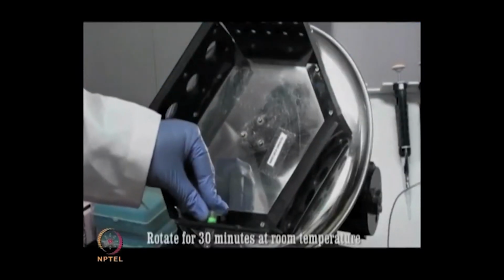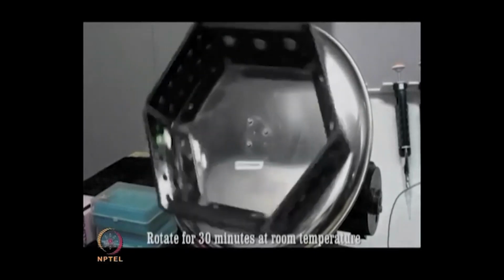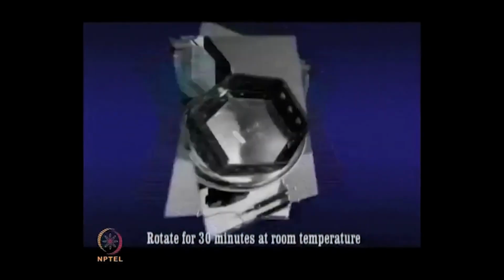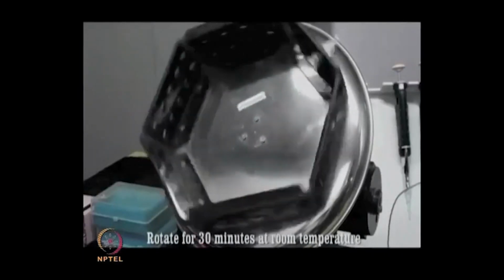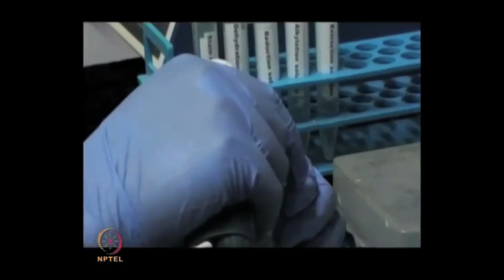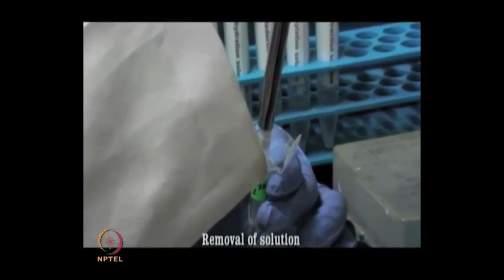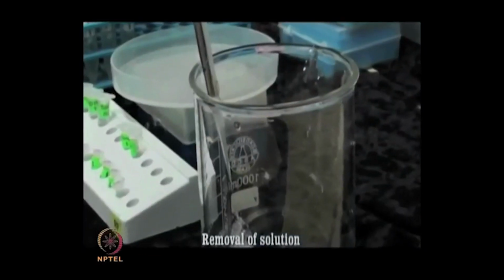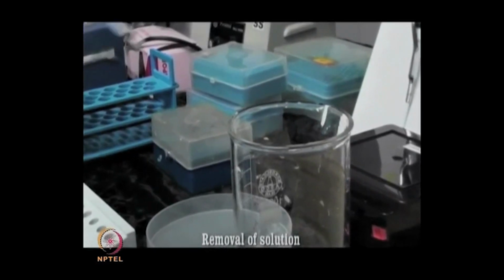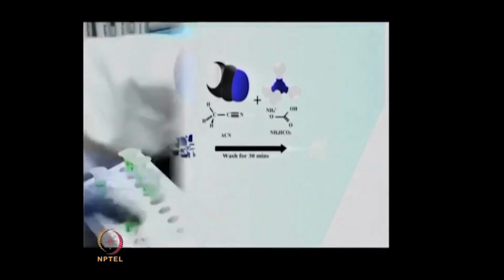After addition of the stain removal solution, rotate it on a shaker for 30 minutes at room temperature for complete removal of the stain from the gel pieces. It is recommended that you change the solution after every 10 minutes. By changing the solutions and removing it after every 10 minutes, the Coomassie Brilliant Blue stained gel pieces become colorless. So, you have seen the animation.